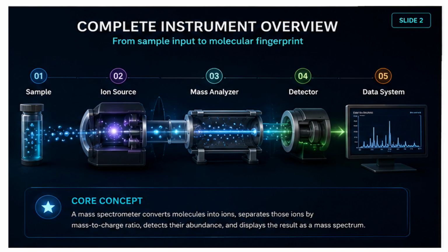Third is the mass analyzer. This is the separation area. It separates ions according to their mass-to-charge ratio, or m/z. Fourth is the detector. The detector receives the separated ions and converts them into electrical signals. Finally, the data system processes these signals and displays them as a mass spectrum. So, from sample input to molecular fingerprint, mass spectrometry gives us detailed information about the identity and abundance of molecules.